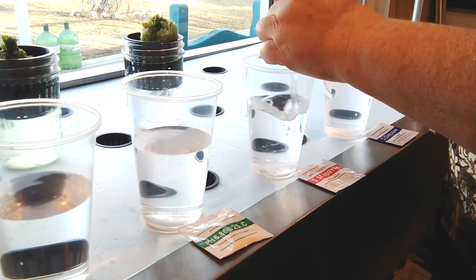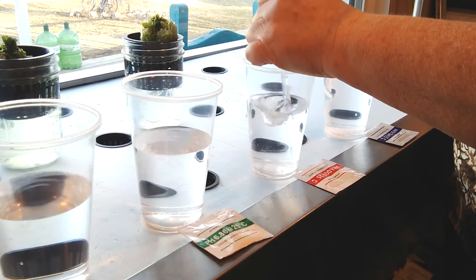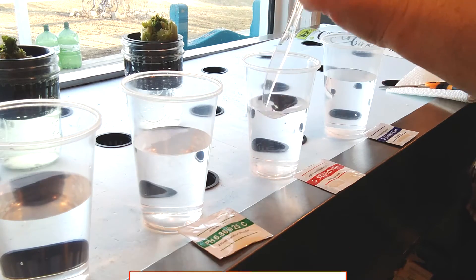It's important that you keep your packets with the correct unit of water. You want to make sure you don't mix them up because this does have to be done in a specific order.